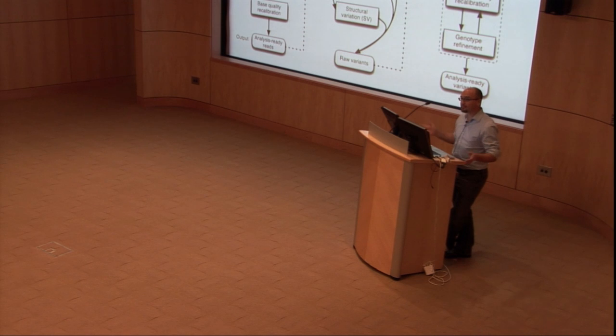You then have many samples, potentially. You're sequencing your family that has a Mendelian disorder. You have a couple of samples. Maybe you're part of the ESP project where we're doing 10,000 exomes. Ultimately, though, you have some number of samples that you have reads for, and you're going to produce a raw list of variants. So this is going to be SNPs or indels, structural variation. And these would be all sites that could potentially be variable. There's some evidence in the data such that you could have a SNP there, or you could have a machine artifact.